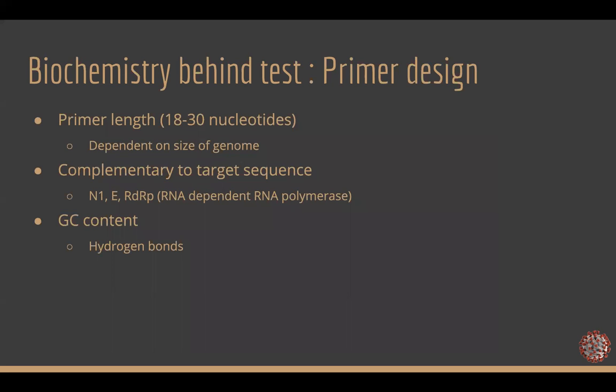So a little bit more about the primer design. Again, these primers are designed to bind to specific target regions of the template in question. And these primers will typically be between 18 and 30 nucleotides in length.